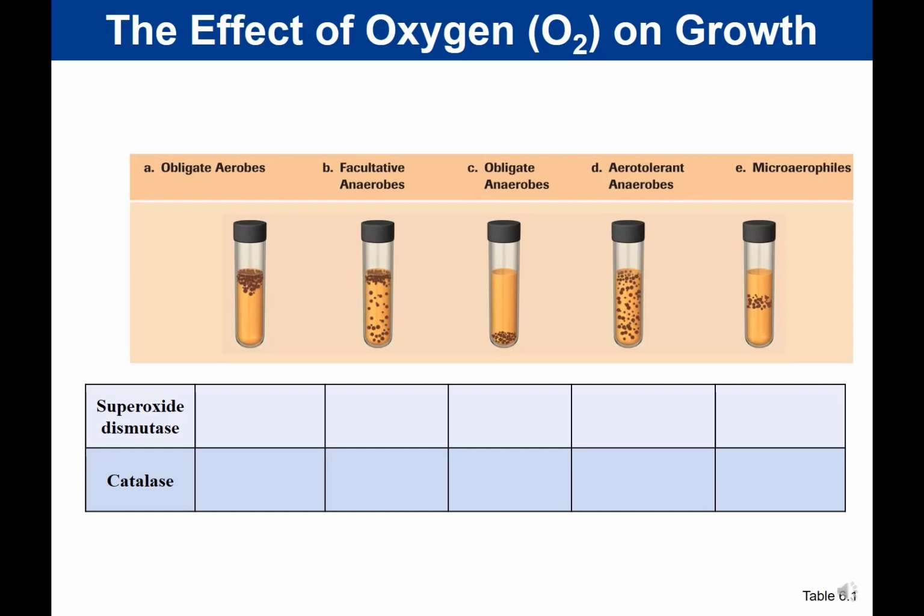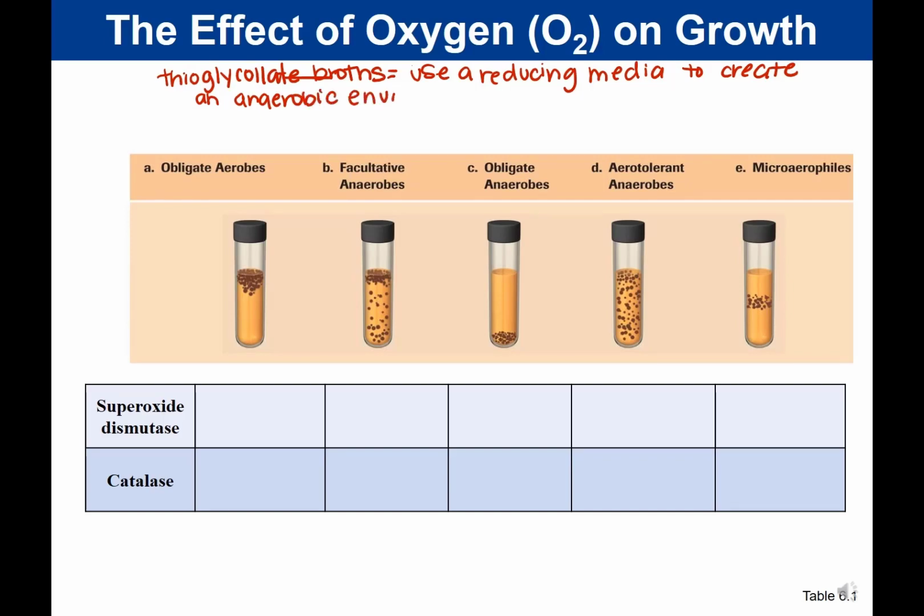You might recall that in lab, we talked about our thioglycolate broths, and that our thioglycolate broths use a reducing media to create an anaerobic environment.